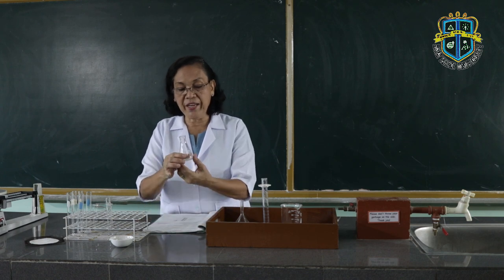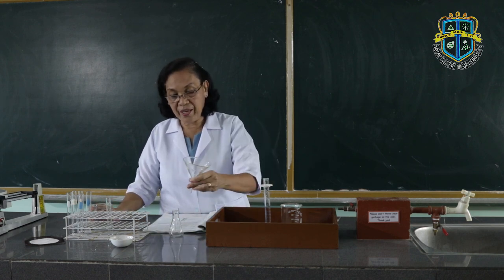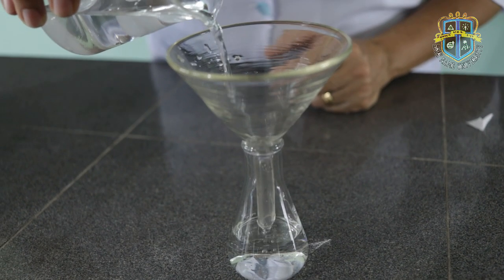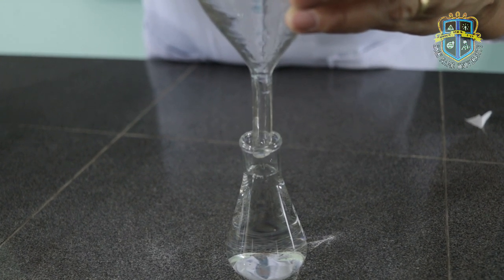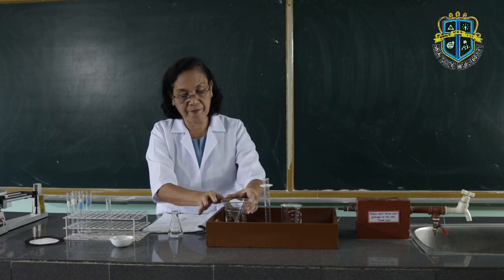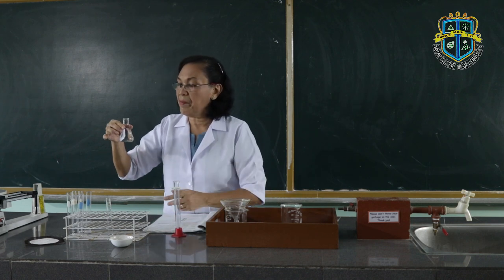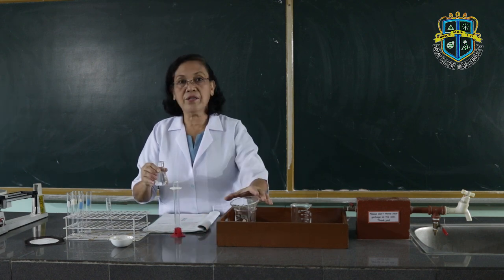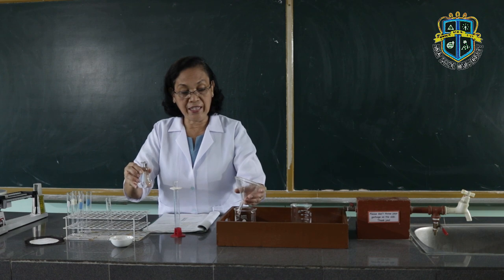We are going to measure the volume of liquid that this Erlenmeyer flask can contain, so let us fill this Erlenmeyer flask with water using a funnel in order not to spill the liquid, and fill it up to the brim. Take note that this Erlenmeyer is marked 50 ml. However, our graduated cylinder is only marked 25 ml, so what are you going to do? You are going to measure the liquid inside this flask in two batches.